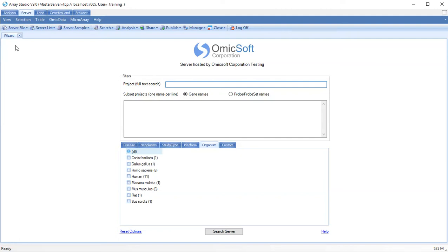Array Suite includes a set of tools for managing datasets associated with samples and grouping those samples into sample sets. In Array Suite, a sample can have one or more data files, such as FASTQ sequencing data, a BAM file of aligned data, a VCF file with variants, or a microarray cell file, etc. A sample set is a smart grouping of multiple samples, usually grouping samples within an experiment. These sample and sample set groupings are especially useful for pipelines and visualization in views.